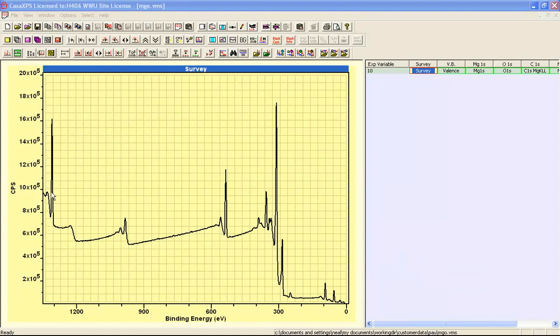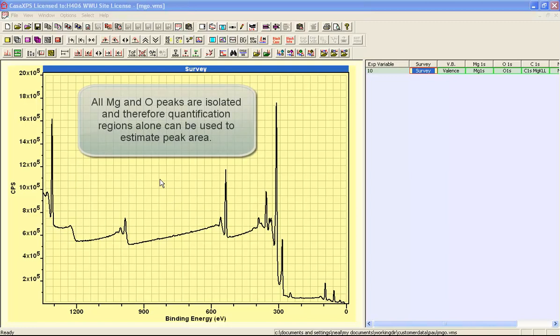It should be one to one. Each of the peaks that we have from magnesium and oxygen are well separated, so regions can be used to estimate peak areas.